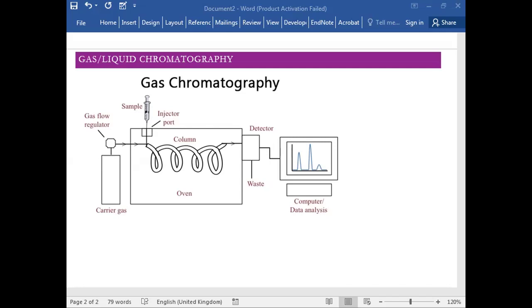Is that correct? Now, the quantity that we are concerned with here is called retention time. What is it called? Retention time. So the more attracted our component is to the stationary phase, the more retention time it will have. Is this clear? Yeah. So now let's make it simplified for ourselves.